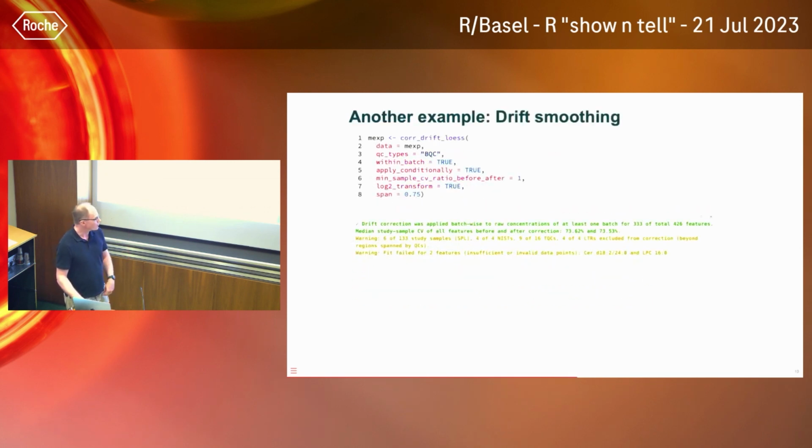Just another step is, so what we always have in this analysis, I will show you later another example, is that the instrument changes sensitivity or performance, so we have shifts and everything, and we correct for this. That's a big topic, and there are a lot of packages for this, but many of them just apply a standard correction for this effect. So we try to find a sweet spot in the parameters that we use. We force the user to define some parameters, but we also leave some parameters modifiable but optional, so that if they don't understand it, they don't have to give some completely wrong answer. That's always a big question.